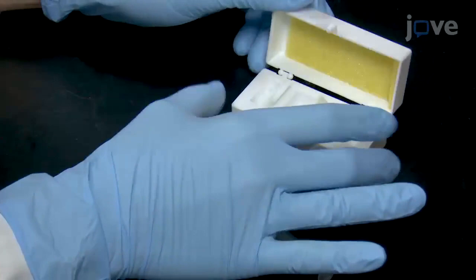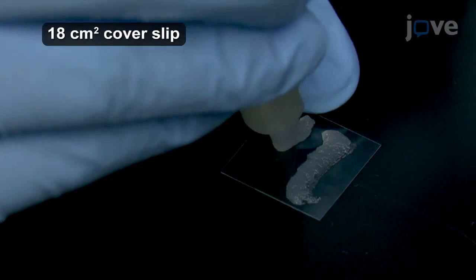If the chamber will be used for static imaging or injection experiments with minimal solution flow, then use a syringe to apply two parallel strips of petroleum jelly to a coverslip, one centimeter long and 0.5 centimeters apart.